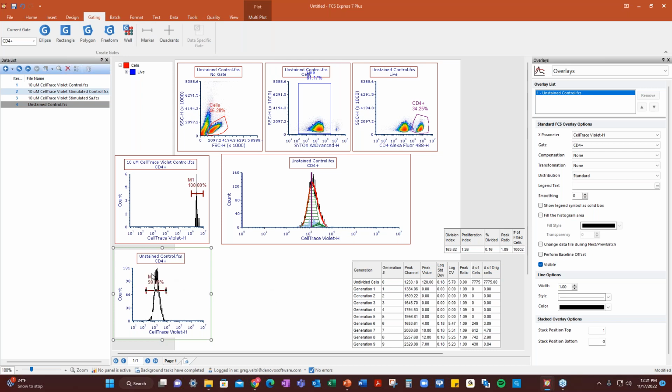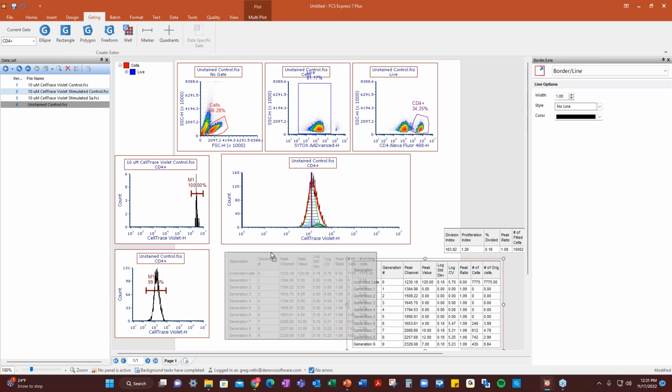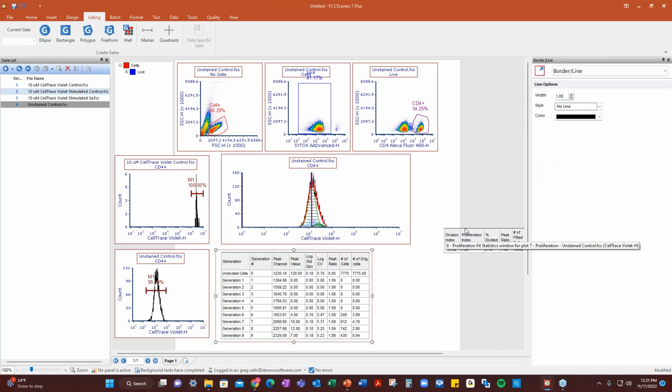Notice that it says M1, M1, but they're very specific to those plots. Our markers are not set up to be gates in the beginning. They're set up to be just markers, because if I do multiple markers, I'd have a lot of gates, right? They can be turned into gates, and we have talks about that, but for today, we're just going to keep them as markers.